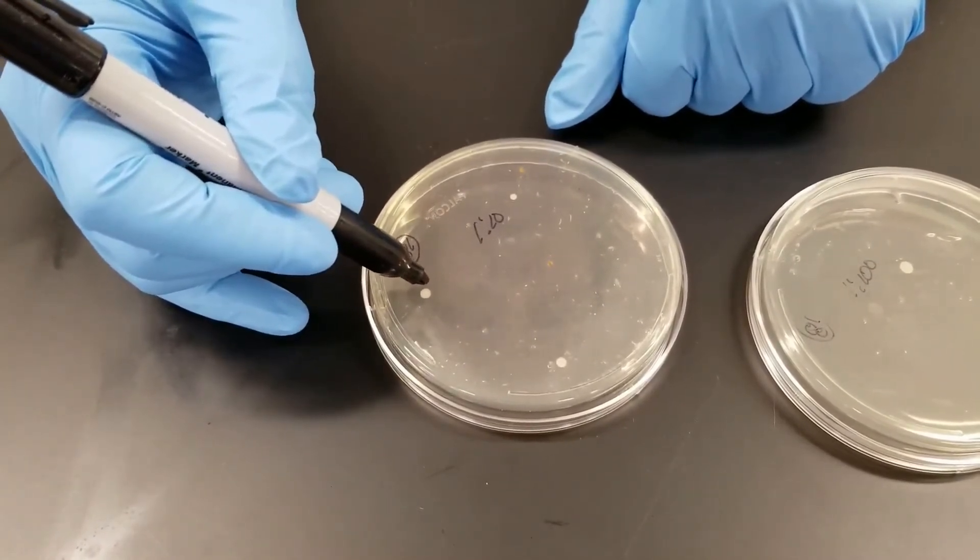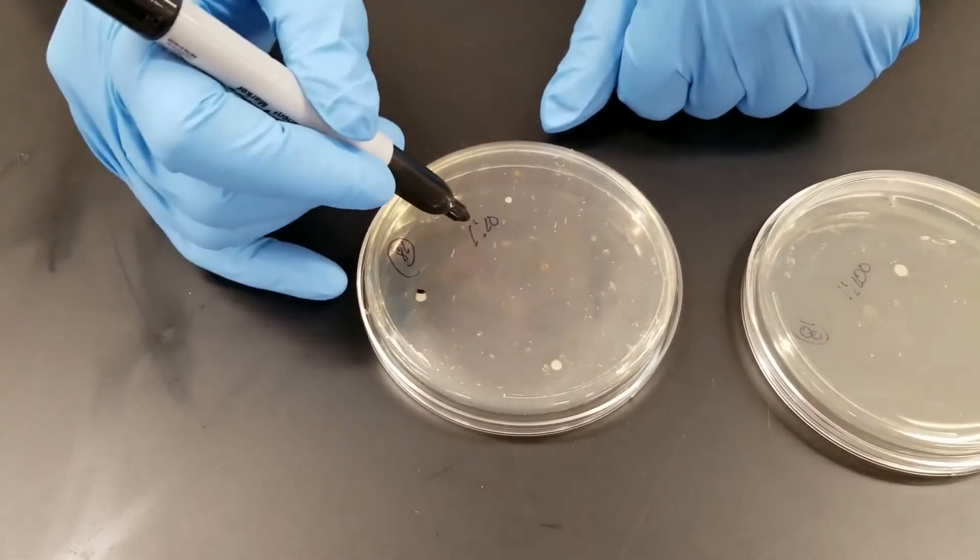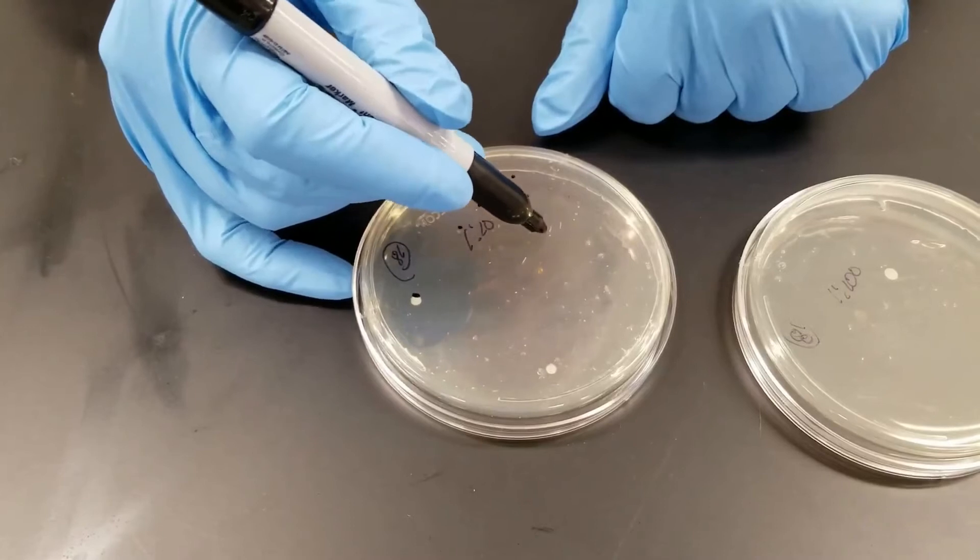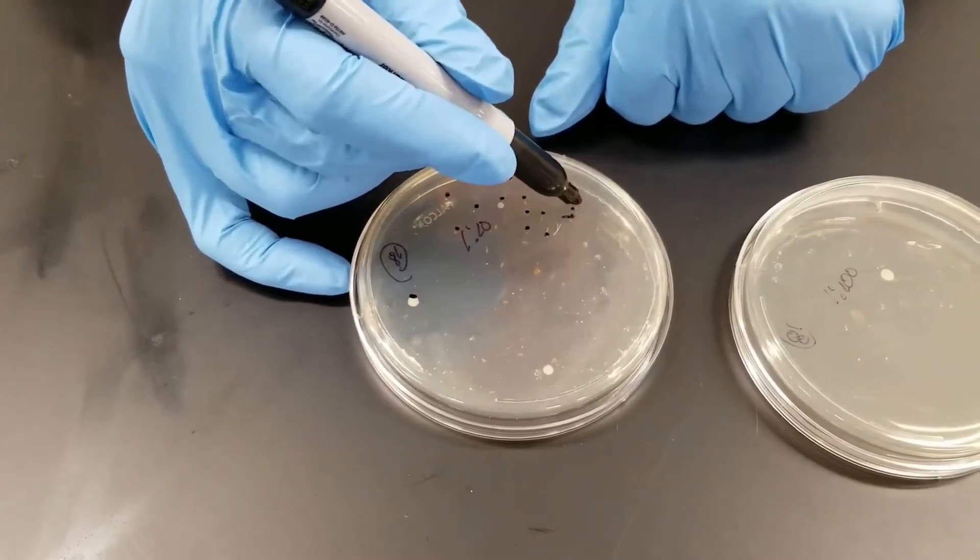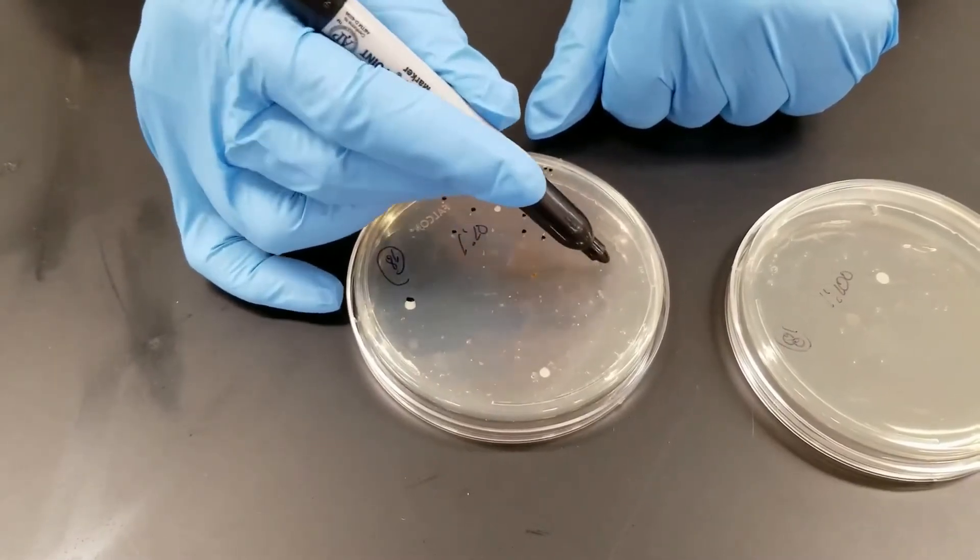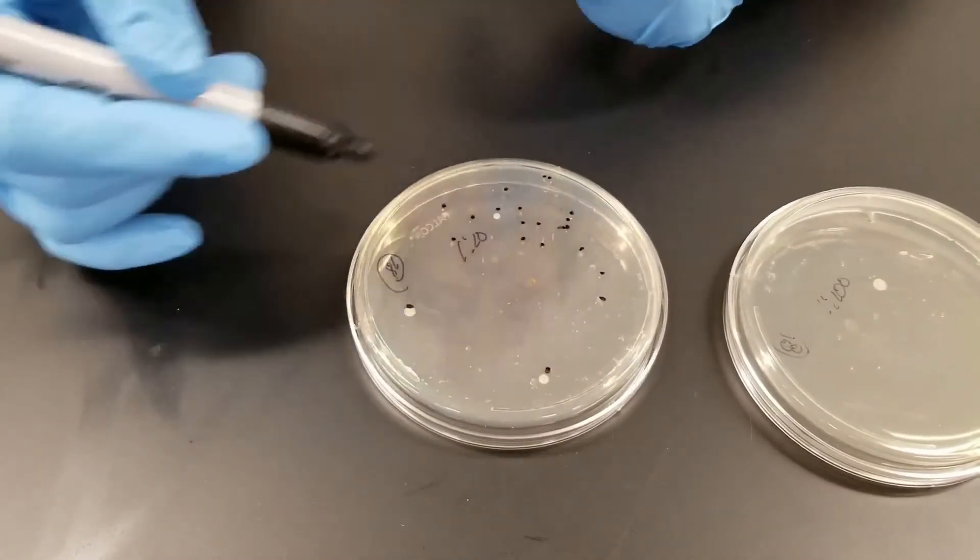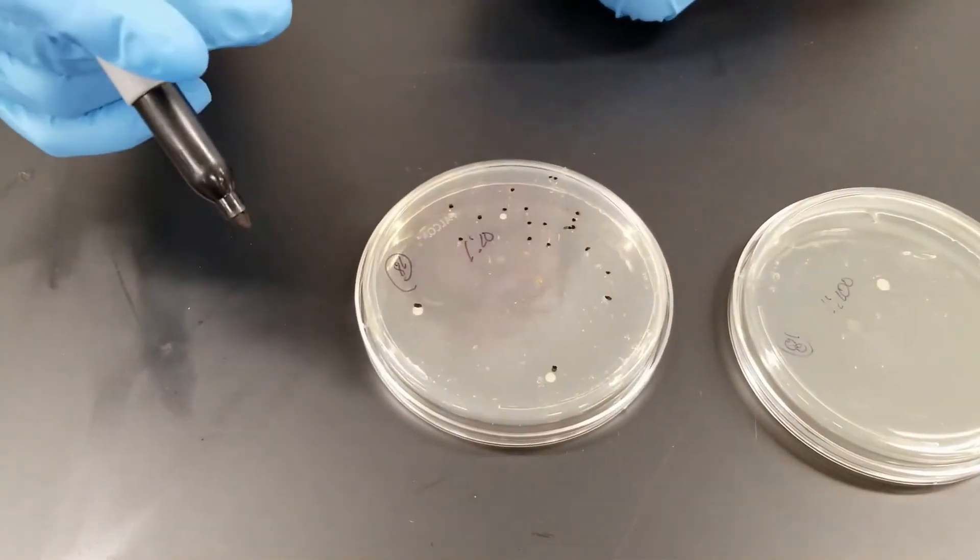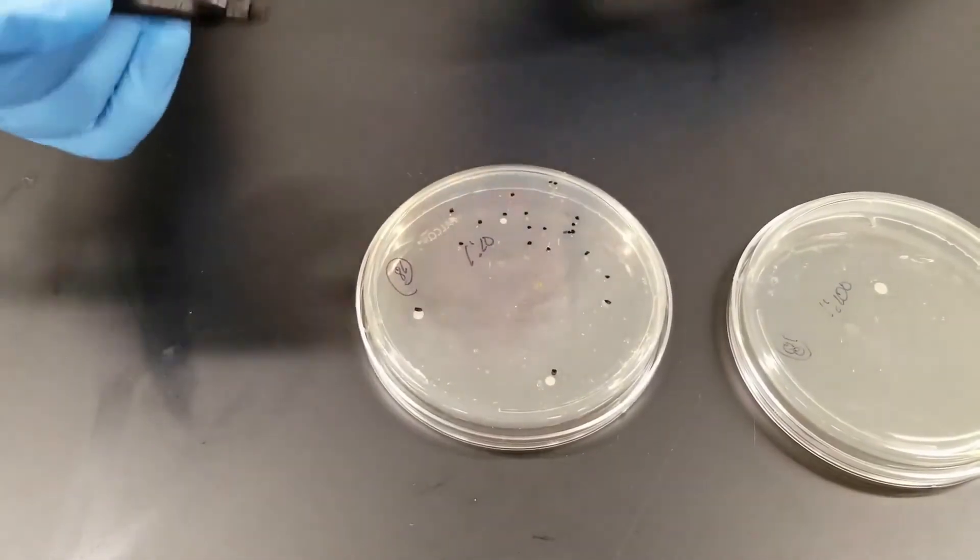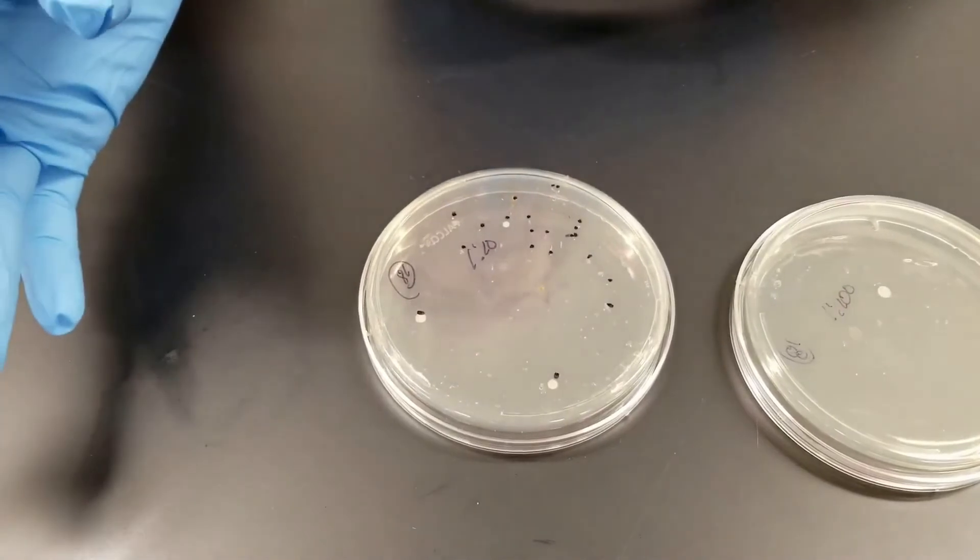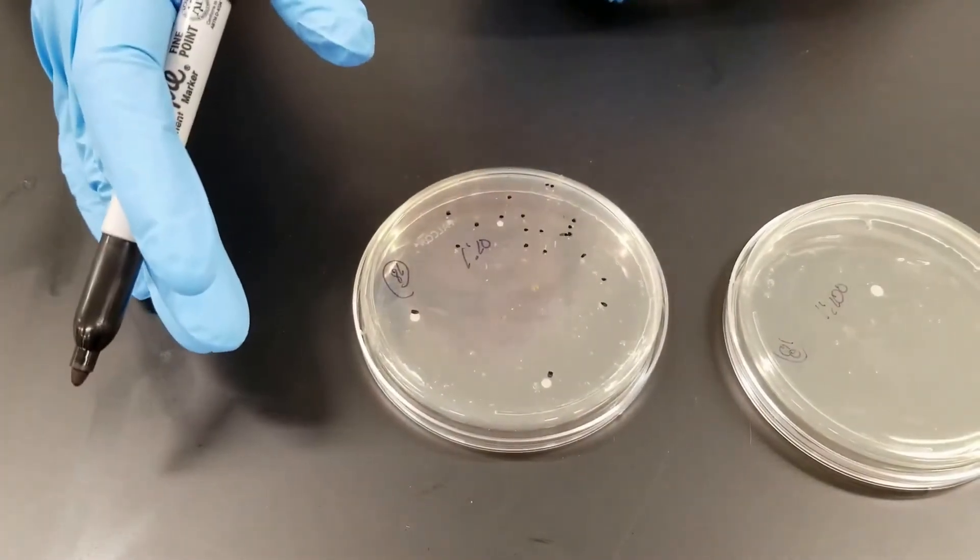And you just kind of mark as you count the bacteria. So if you were to count and start here and go 1, 2, 3, 4, 5, 6, 7, 8, 9, 10, 11, 12, 13, 14, 15, 16, 17, 18, 19, 20, etc., and you would just continue counting the entire plate and mark, and that way you know what you've counted or not. Like I say, you don't count over 300 and you don't count less than 30.